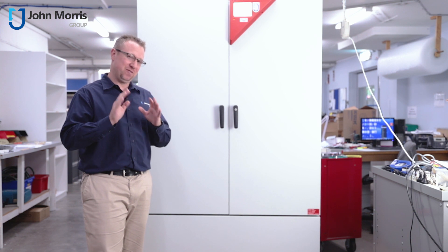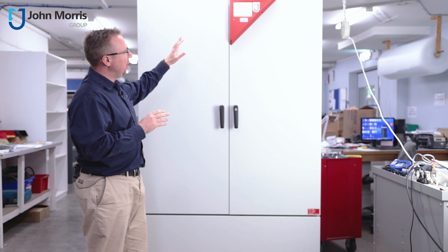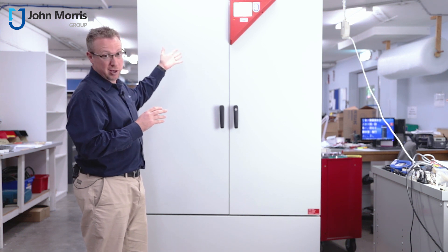We don't usually shoot videos in our QA area, but this unit is a little too large to fit into our photographic studio. The 720KBF from Binder is a rather extraordinary piece of kit.